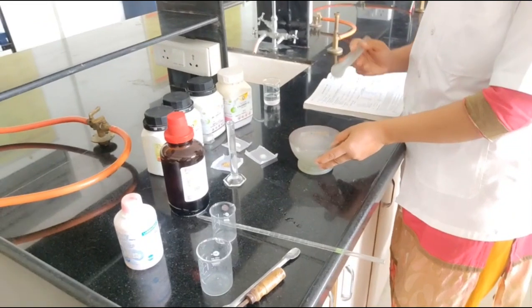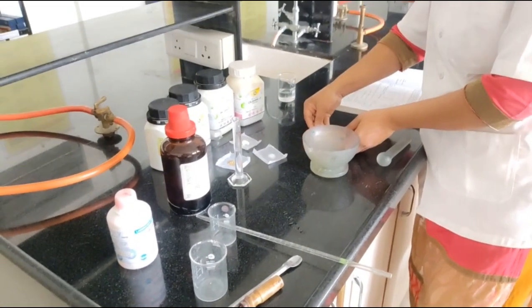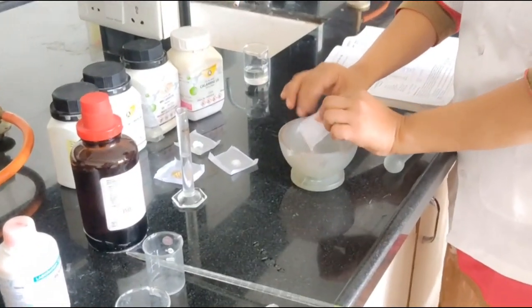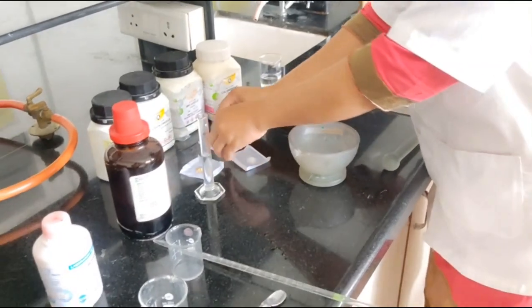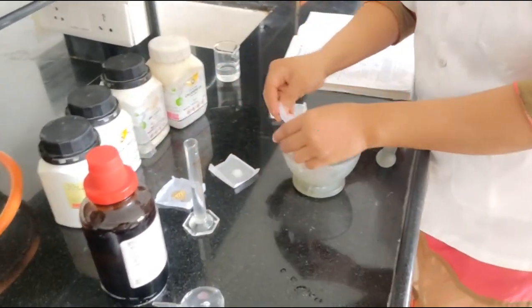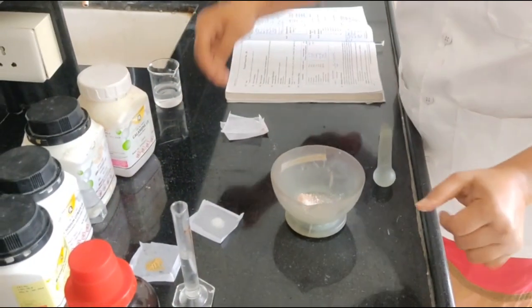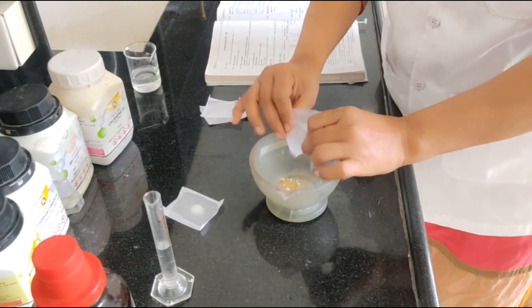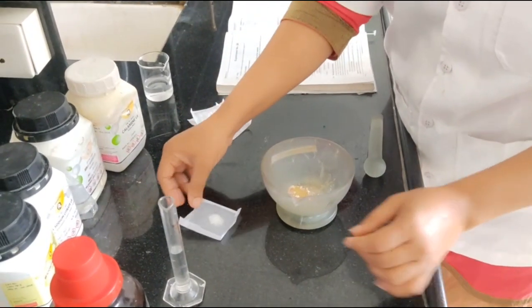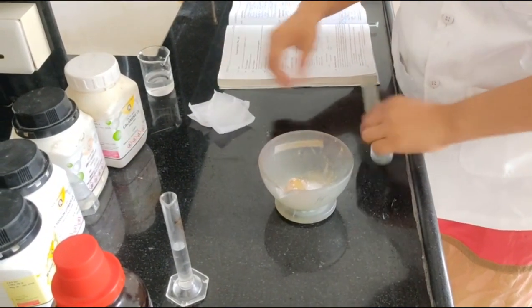First of all, take a mortar and pestle. In that, add the required quantity of calamine, then zinc oxide and bentonite, and sodium citrate. Triturate it.